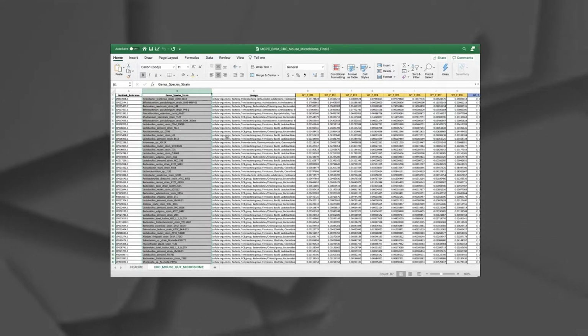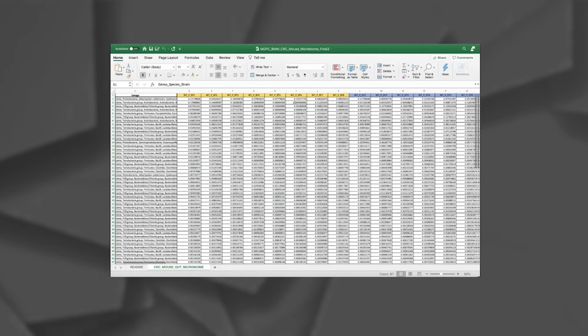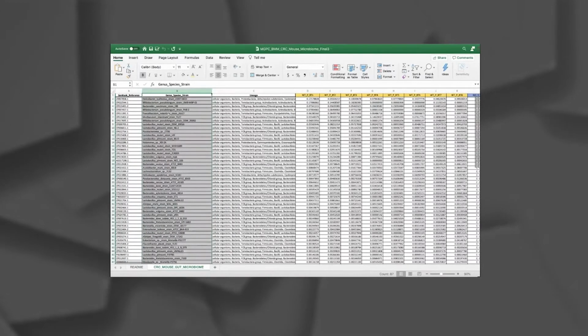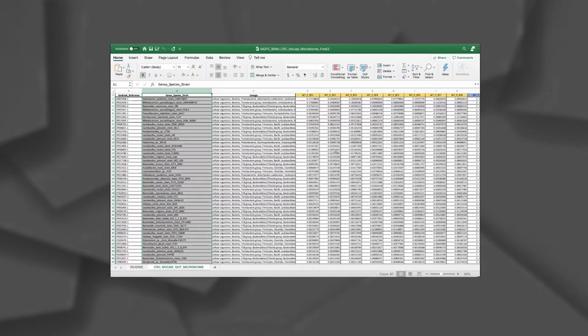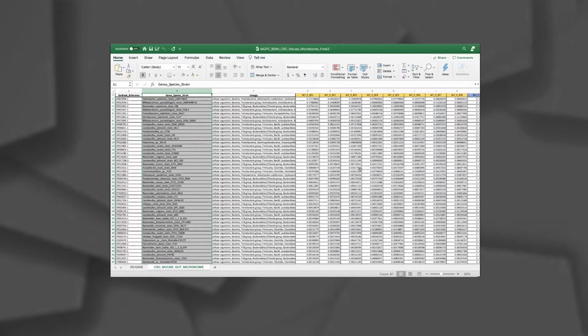And so our group did bioinformatic analysis on these fecal samples and ultimately created this abundance profile table that you see. In this table, the different samples that were collected are shown in columns. It shows the different samples, and then it also shows the organism name here. It also shows extra information such as lineage and GenBank reference number. We then calculated the relative abundance of the different species within these different samples, and that's what's shown here, the relative abundances. And so we use this data to then perform machine learning analysis to answer these 3 questions.